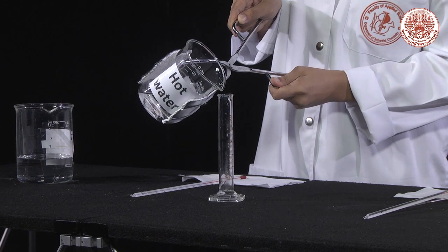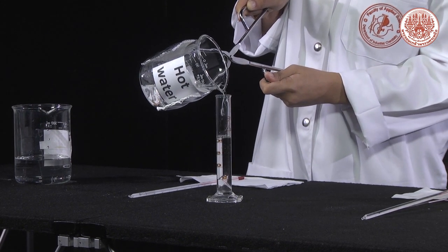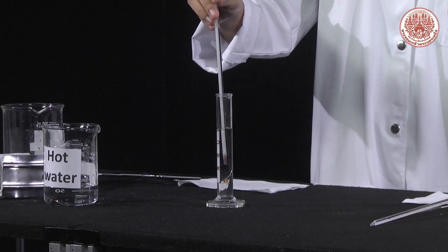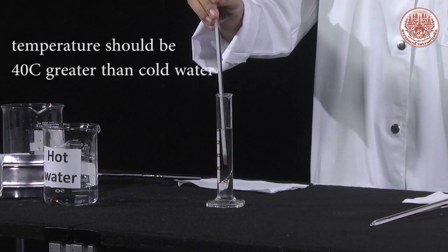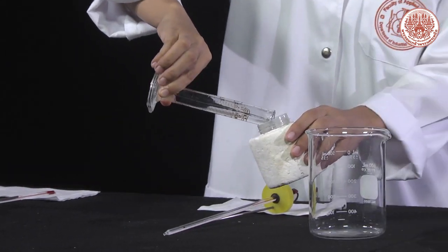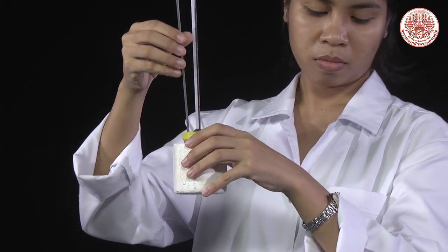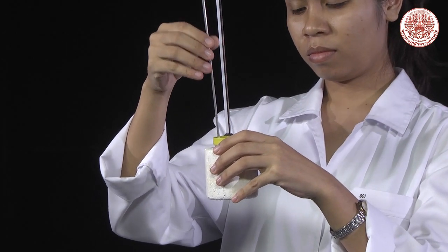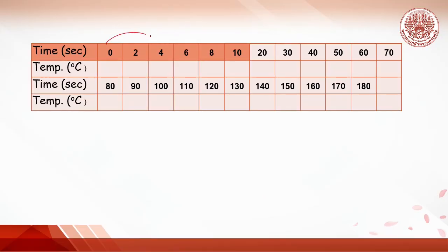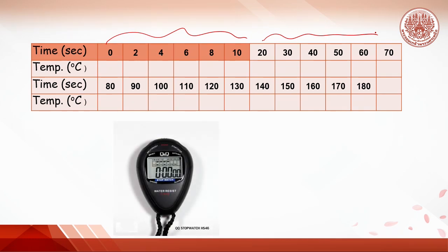Get 25 ml of hot water using a graduated cylinder. Record the temperature of the hot water, which should be 40 degrees Celsius greater than the temperature of the cold water. Immediately pour the hot water carefully into the cold water in the calorimeter. Stir gently and record the temperature every 2 seconds for the first 10 seconds, then every 10 seconds for 3 minutes, or until a steady temperature is obtained. The timer should be ready at the time of mixing, since the temperature will change very fast at the beginning.